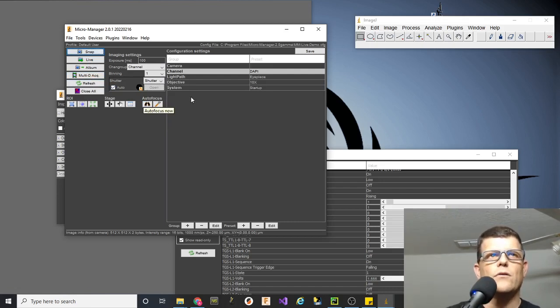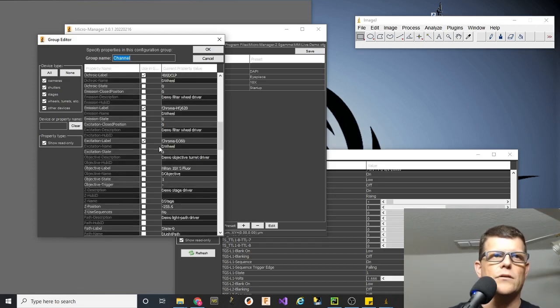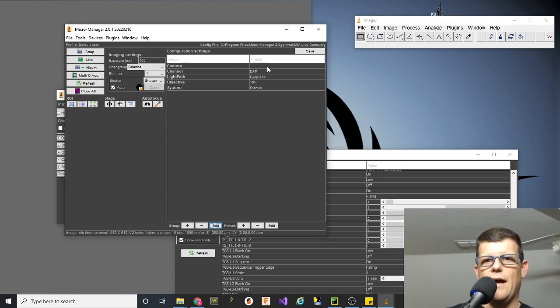So I will show really quick. We'll hit the edit group button, and I'm going to pull out these voltages, just to show the other way of doing this. All right, so in this case, channel only is going to have control over what TTL outputs are enabled. The idea there being that lasers typically have a voltage level in for attenuation, and then they also have a TTL in for on and off control.